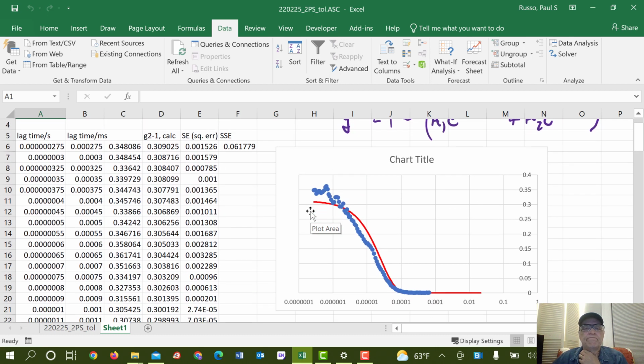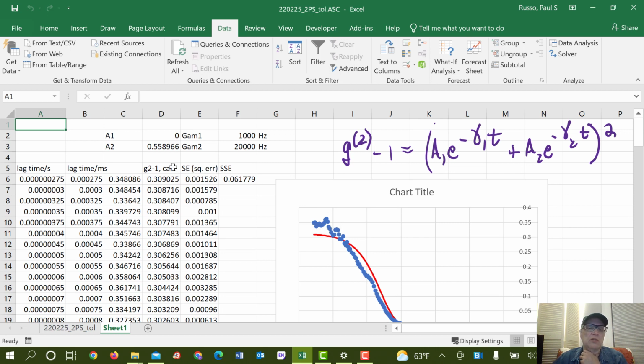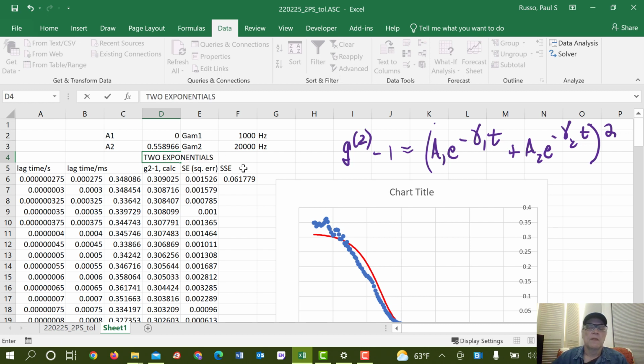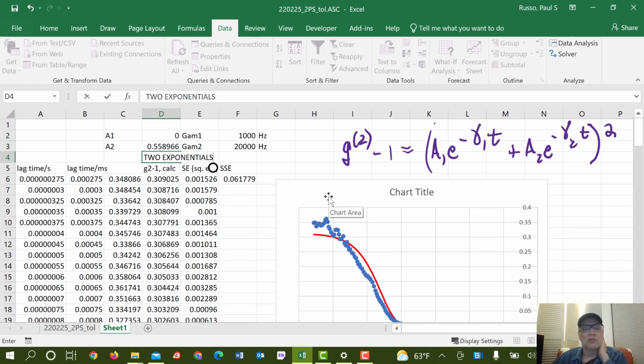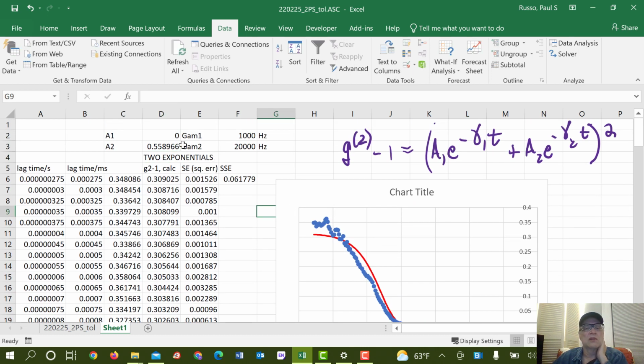Now you could try a single exponential fit, but it would likely be even worse than this. I don't really think this is the best fit that you ever saw. For example, I don't know why it would set that to 0, but it somehow did. And it didn't seem to adjust these, so I wonder if this solver is working or not. Let's go again and see.